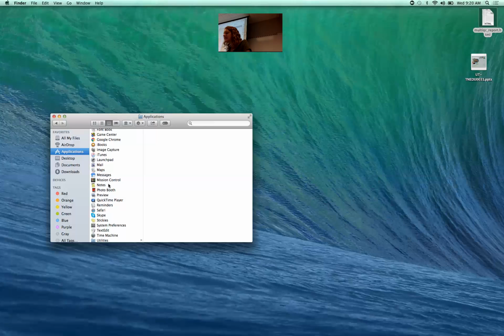And so we can see her data is also RNA-seq, and she has a much higher percent of duplications. So she has a lot of reads from genes that are probably very highly expressed, but I'm not worried about that. It also has millions of sequences. So she can see that for some of her libraries, she got 3 million reads. Like this one in particular, she only got 3 million reads. For some of her libraries, she got 37 million reads.